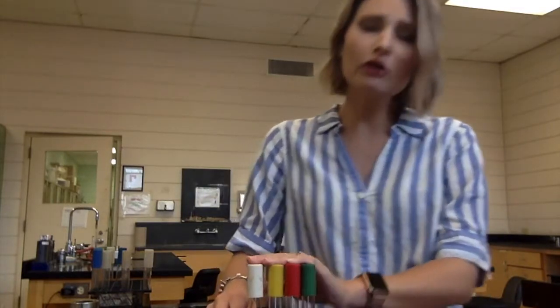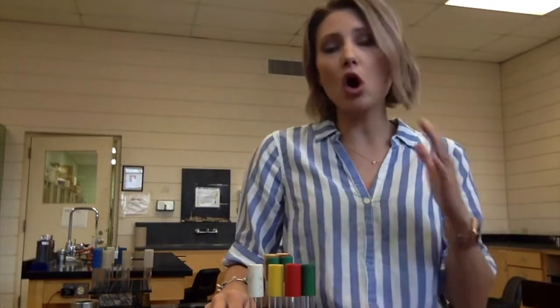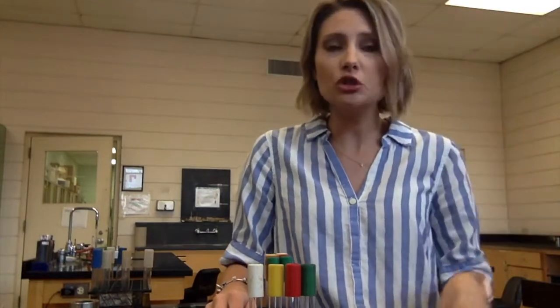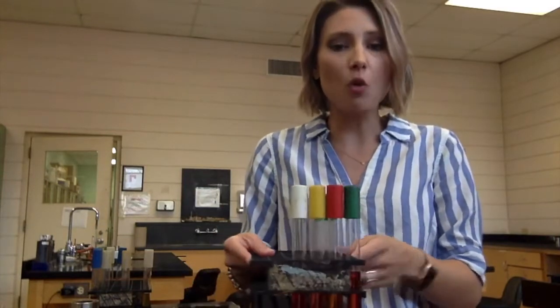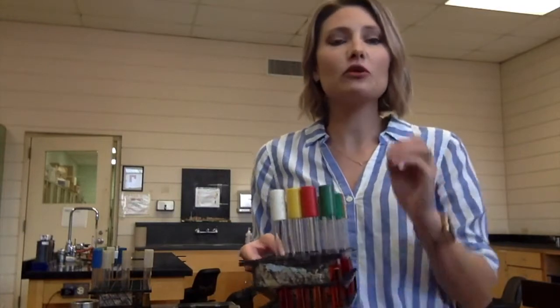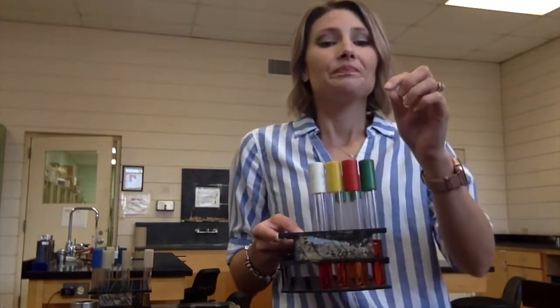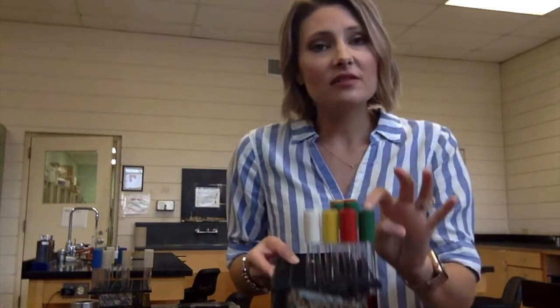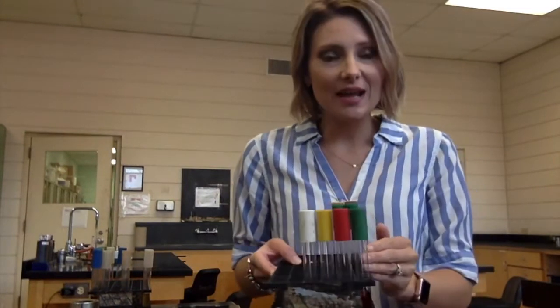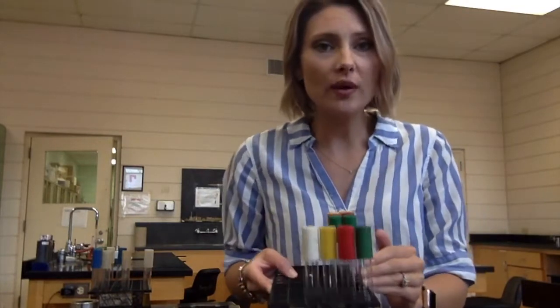Now, there are lots of different sugars that you can test. If you Google carbohydrate fermentation, you're going to see that there are lots of sugars that you can test for fermentation. We are only testing 4. So we've got our 4 tubes here. And like I said, we're testing for fermentation in all of them, acidic fermentation. So does the bacteria take the sugar, ferment it, and produce acids? If acids are produced, the pH is going to drop.